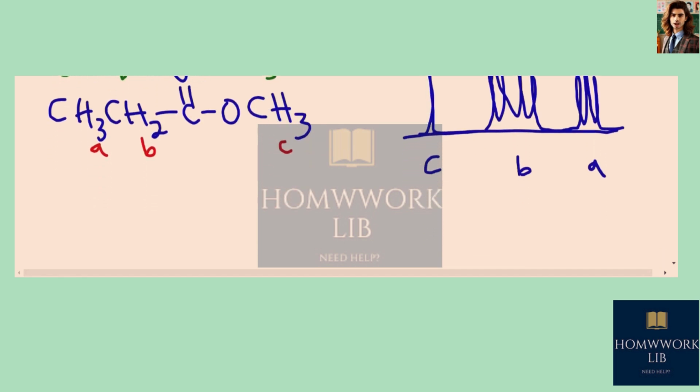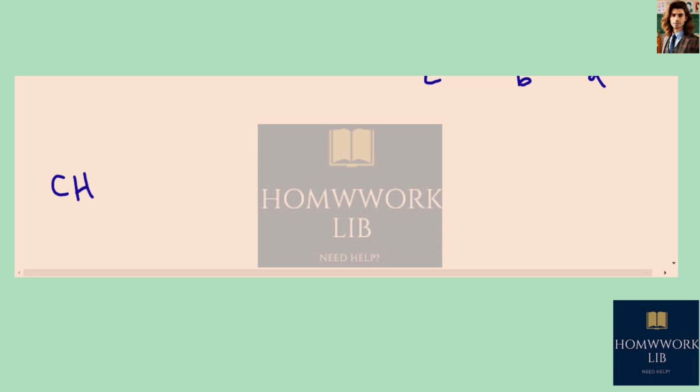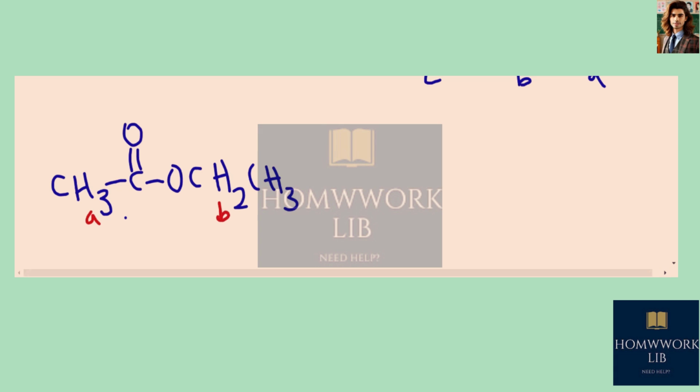So if we move on to the next ester, we can draw a structure that looks like this. So there can be an ethyl group after the oxygen. This will also have 3 types of protons, but the splitting will be different in this case.